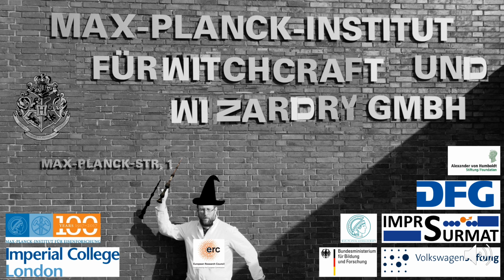There's been work by other groups, obviously. The group at Oxford did quite some awesome work on cluster identification through machine learning, for example. So we're not the only group interested in this. And again, if I get back to my initial graph, there are many other aspects that would benefit from removing user input to make things better, for example the peak assignment or measurement of the composition or decomposition of the peaks. So we are pushing a bit in this direction. You have these very complex mass spectra, and we managed to associate to all of these peaks an identity that is not completely meaningless. So there's a lot of work that needs to be done, but it's getting there.